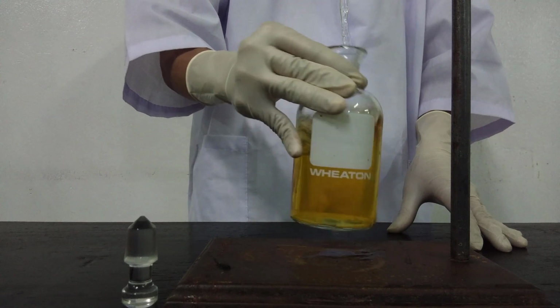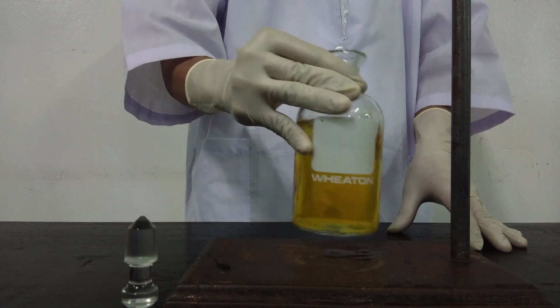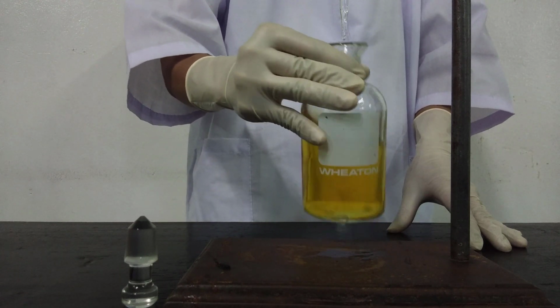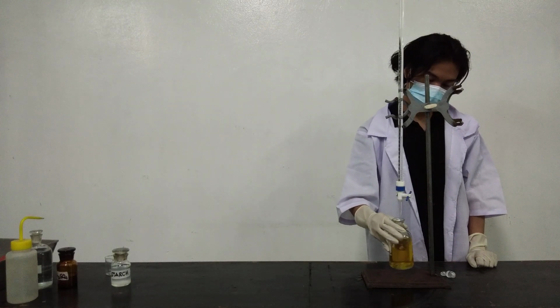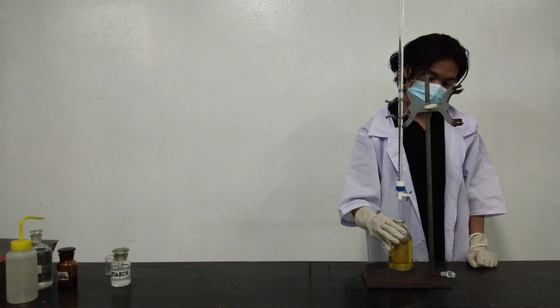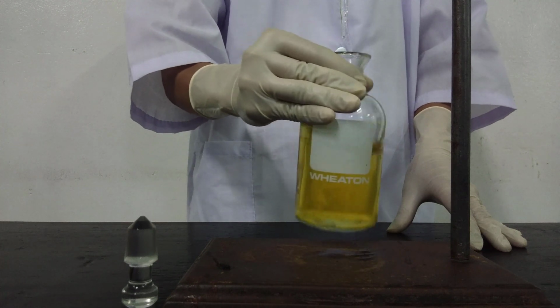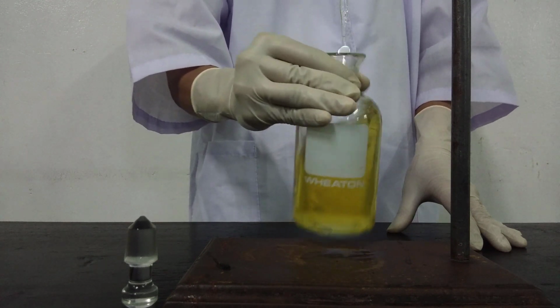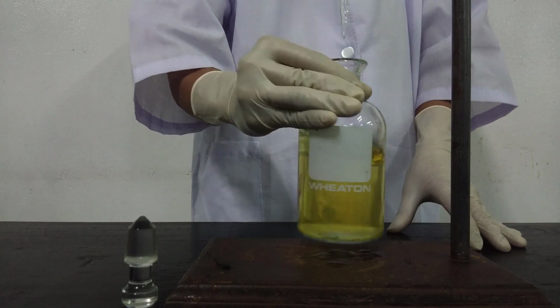This is for the 200 ml remaining sample. After titrating to a pale yellow color, discontinue titration.